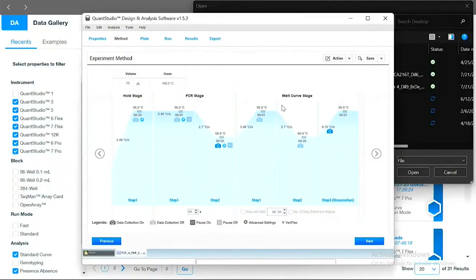And that melt curve can give you information about the width of that melt curve can tell you about the amount of side products, or additional peaks can tell you information about specific side products. So there's definitely some metrics that we can take out of the melt curve and apply to the quality of our data. So definitely during the development stage, I highly recommend a melt curve.